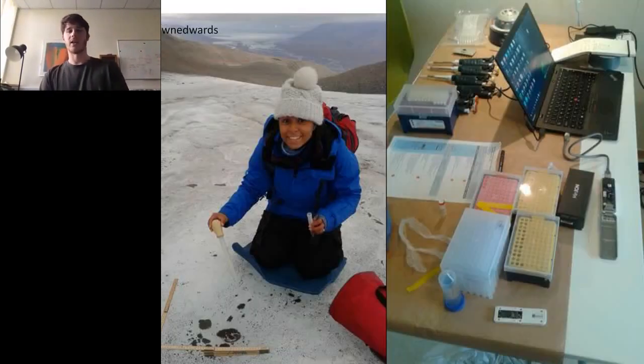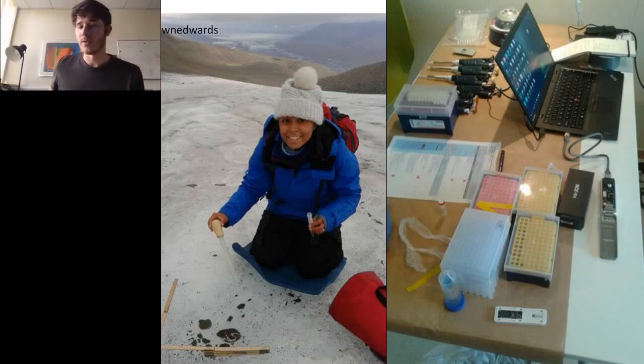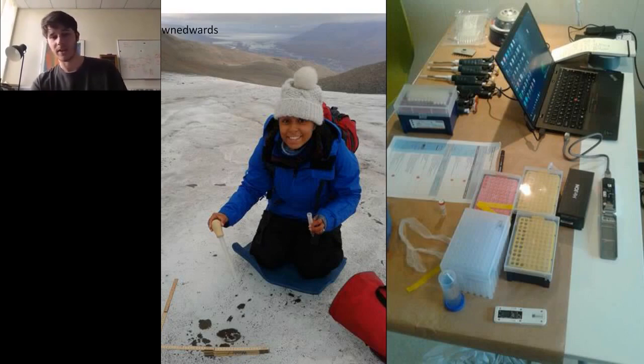This is an example from Arwyn Edwards at Aberystwyth University, where he's doing DNA sequencing in the Arctic at the 78th parallel. He's collecting samples, doing the analysis in a mobile lab, and then making a decision about what to do next, maybe move the sampling location, or give up altogether, or something like that. So that's an example of where you can improve the efficiency of working in these types of environments.